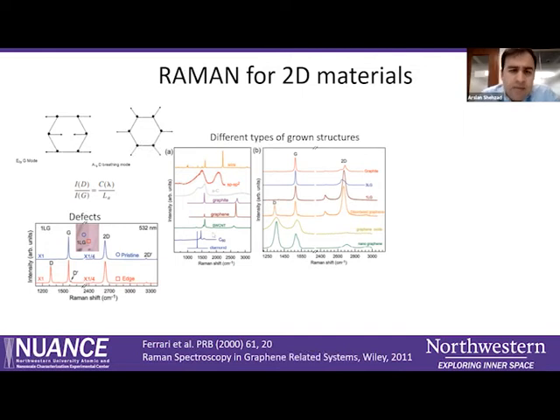Similarly, a lot of work has been done in determining different perspectives of the Raman signals on these 2D structures, for example, in the case of graphene, the sp2 bonding states of graphene in the amorphous case, and then the crystalline case, and then graphene single wall carbon nanotubes.